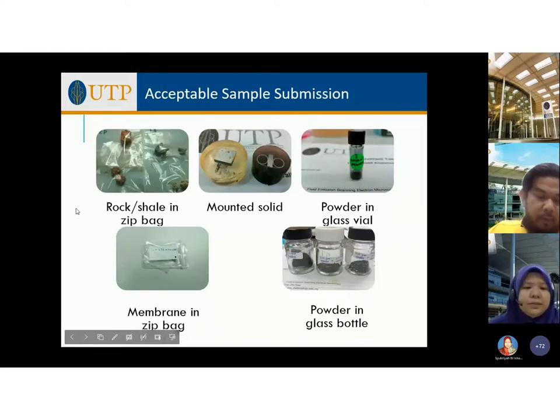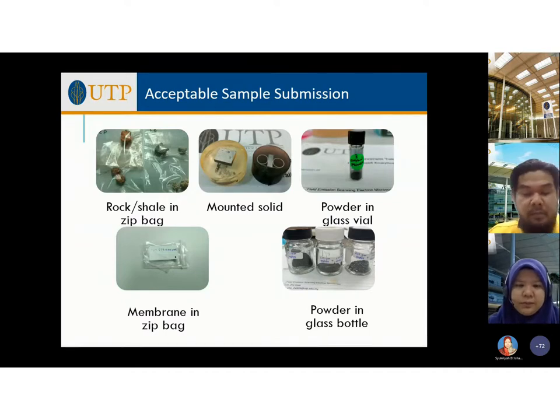Okay, thank you. Hope you understand a little bit about basic sample preparation before I do SEM, FESEM. This slide shows acceptable samples for submission. As you can see, the first sample is a rock or shale. Normally I recommend putting it in a zip bag. This is acceptable for submission.